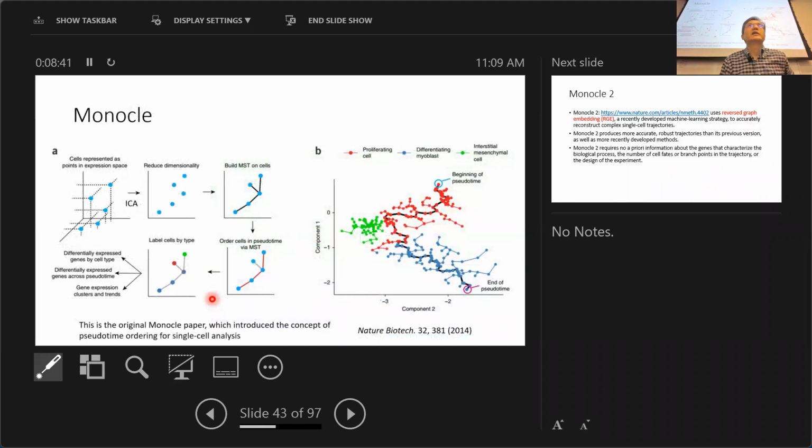Next, we are looking at the most popular pseudotime analysis package called Monocle. Well, Monocle itself, its early publication in 2014, so definitely a pioneer in the whole field. However, Monocle itself is not a stable package. It changed all the time from version 1 to 3. The algorithm used internally completely flipped, changed. So make sure you know which algorithm, which version you are using.